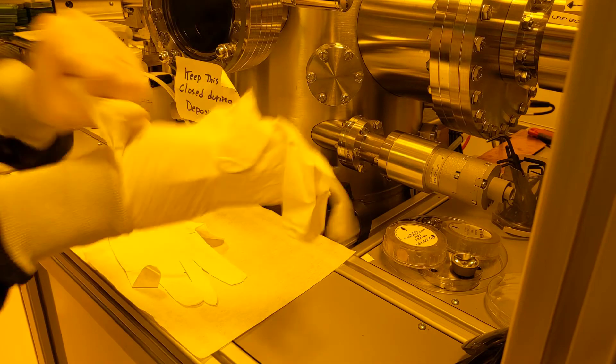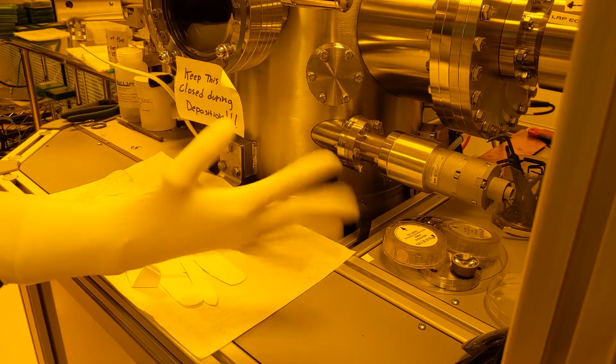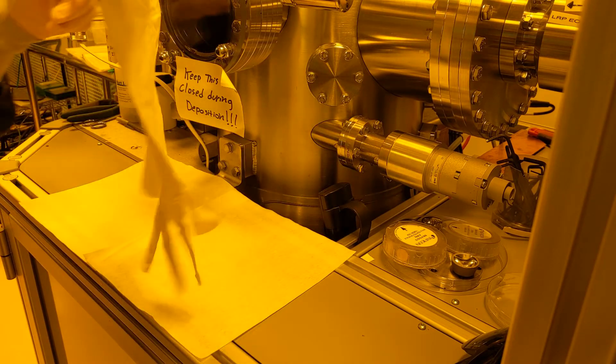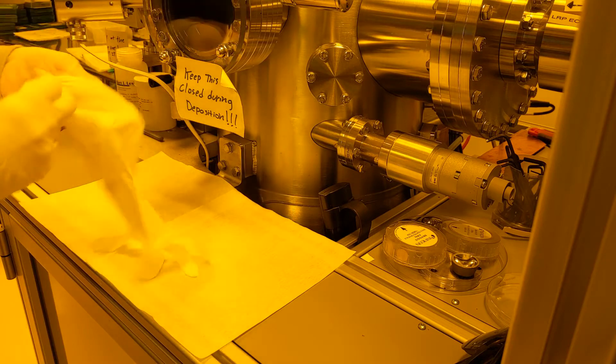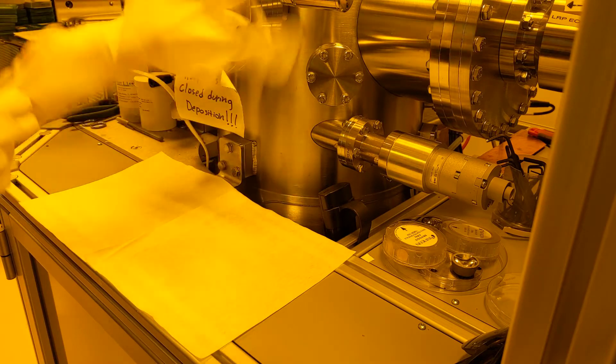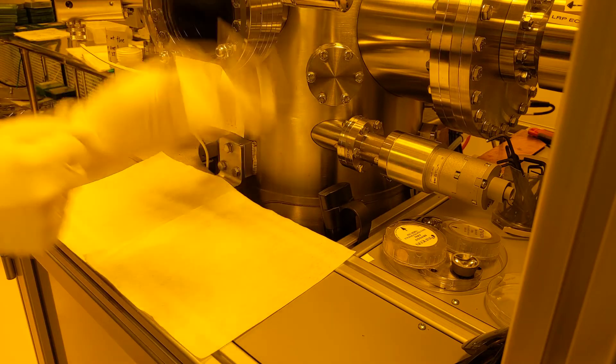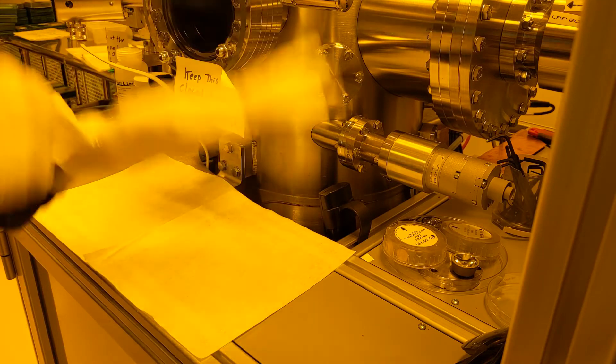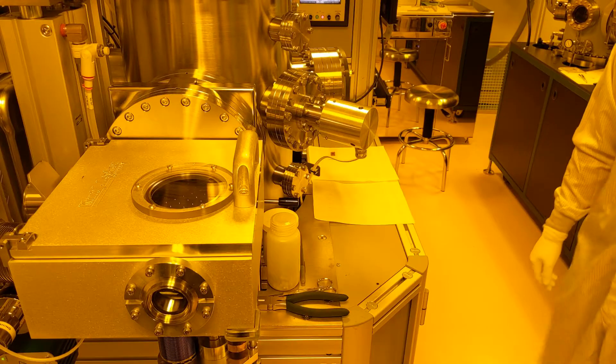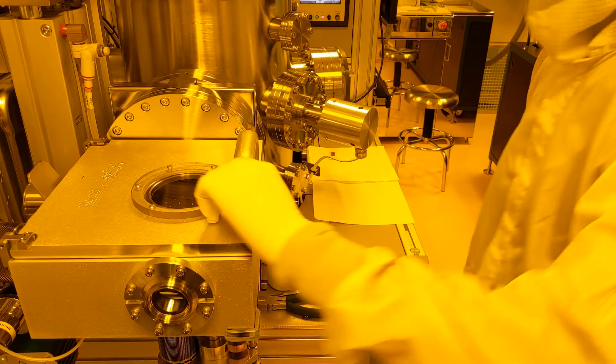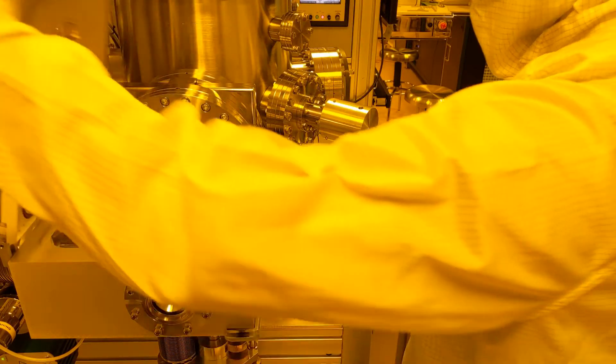Once done, put on a second pair of gloves. When the load lock is vented, open it up and remove the platen.